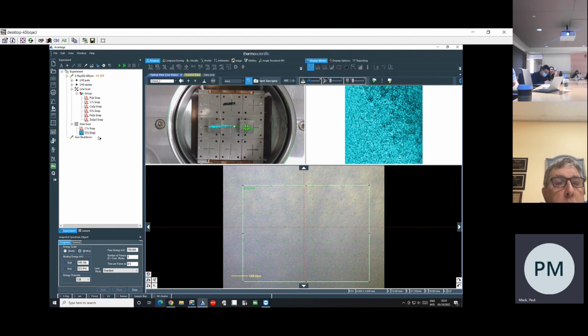The second part of the question, yes, it is possible. It's probably a little bit beyond the scope of this training session. Maybe the best thing to do would be to either write a little explanation or point you towards the help file section on that.